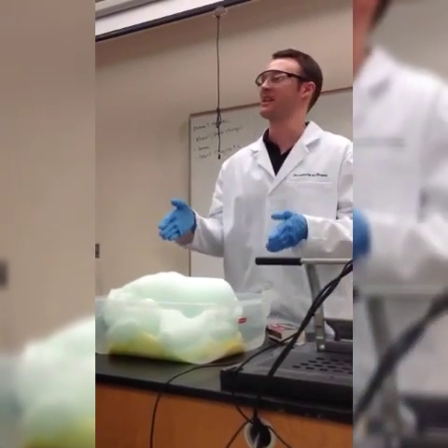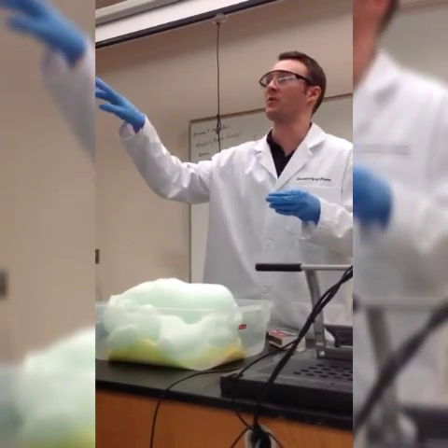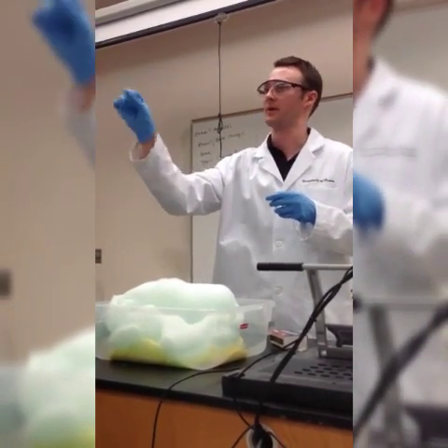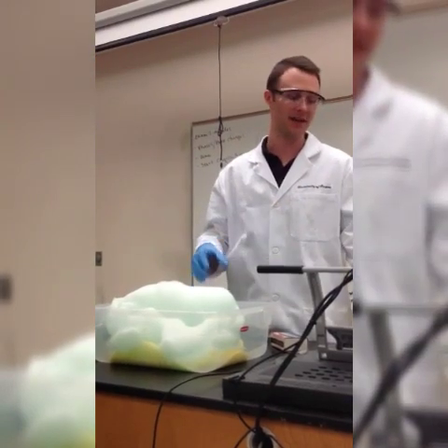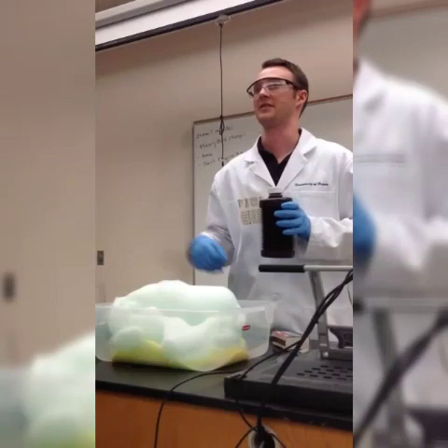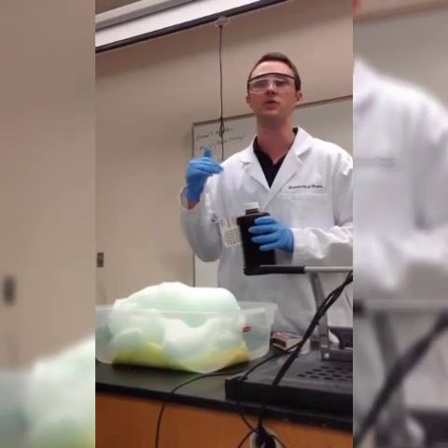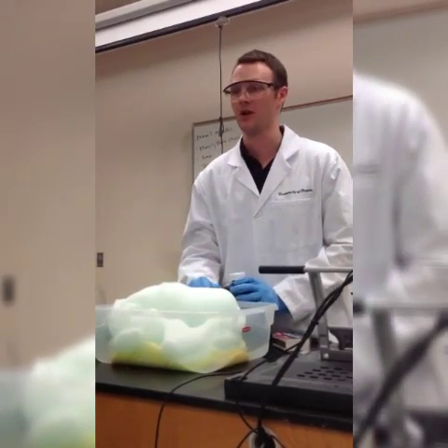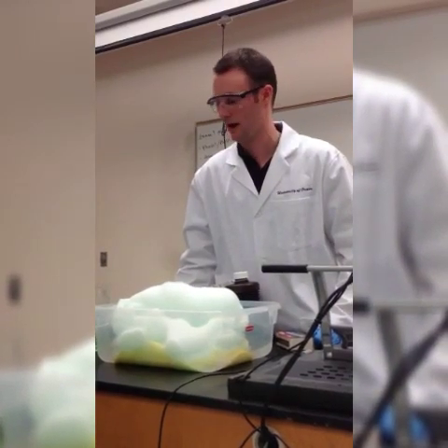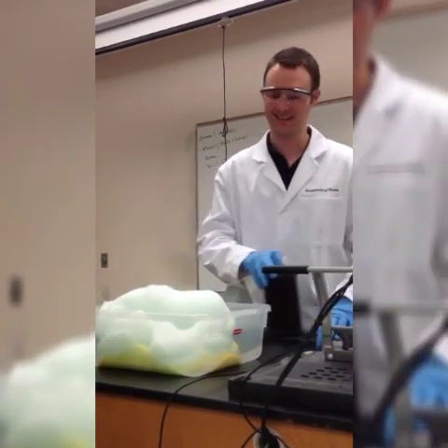So, okay, here's a good example of a chemical reaction. I rearranged the atoms. It still has the same number of atoms, I just rearranged how they were connected. So I took some of that hydrogen peroxide, a strong oxidizer that will bleach your hands, bleach your hair, clean wounds, and turned it into basically just water. Water and a whole bunch of oxygen. So let me clean this up now.